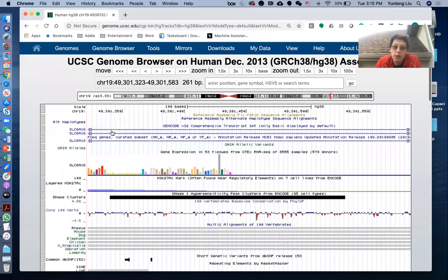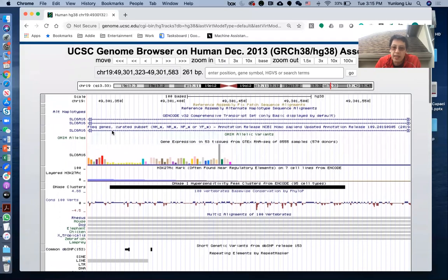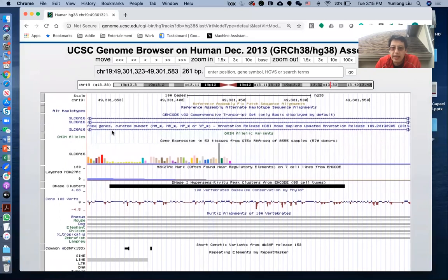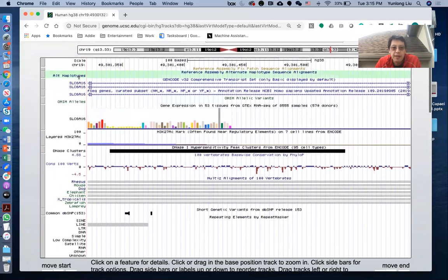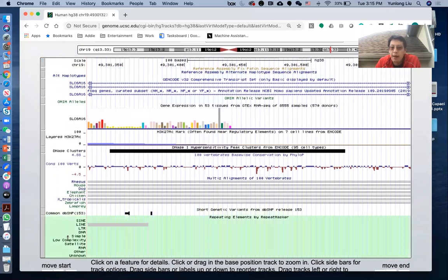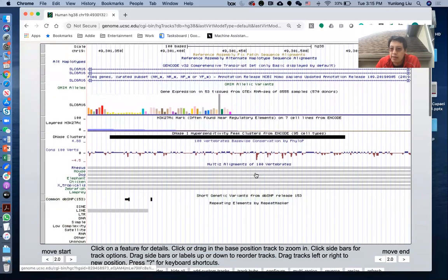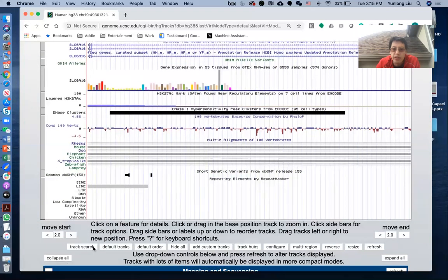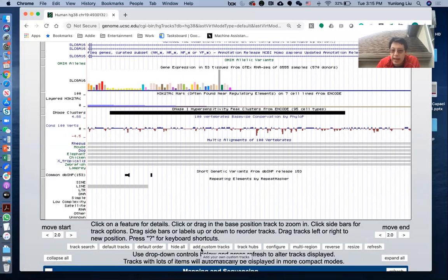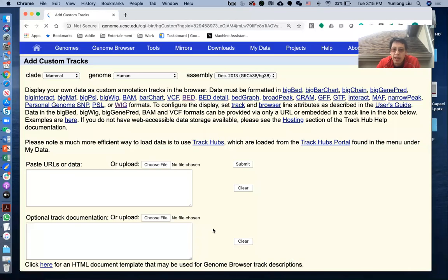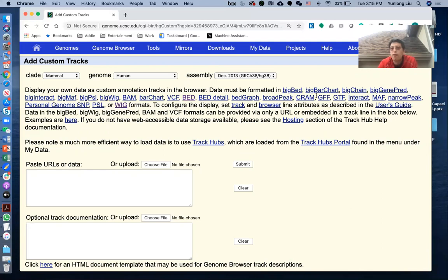What we want to focus on today is how to load your own data. Shortly below this particular data session, you can see there are several different buttons available here. The one that we're going to use today is this one, add custom tracks. So if you click this, you will come to this particular page that tells you there are so many different file formats that you can use to load your data in.